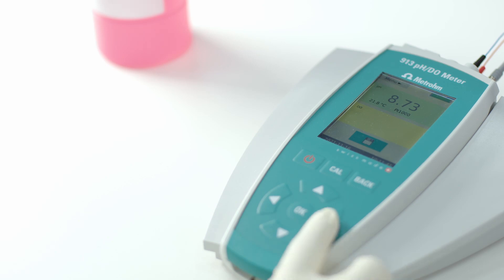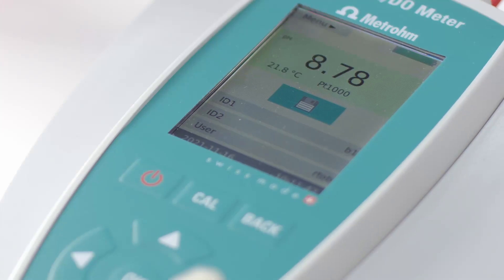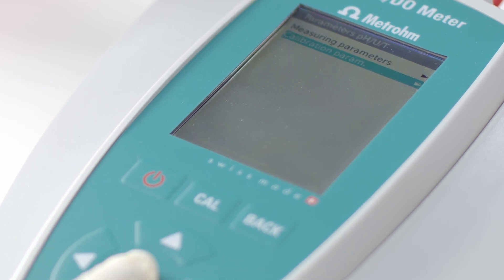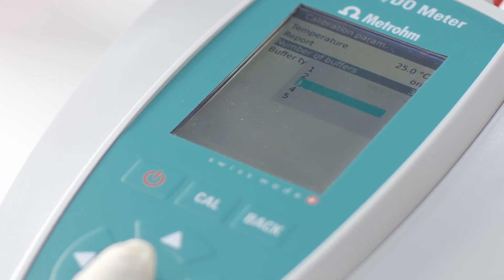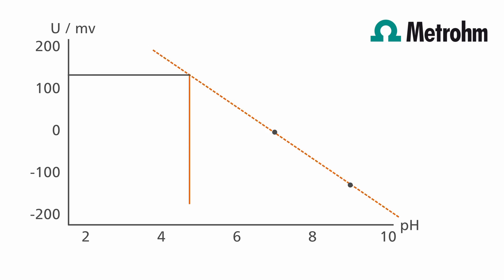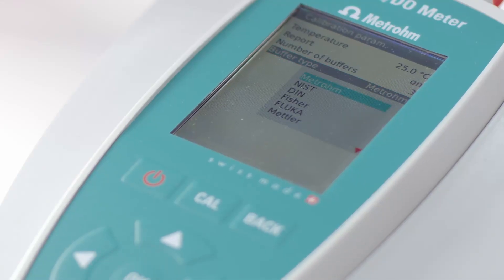Select the corresponding measuring channel in the main dialog. To set the number of buffers, go to the menu, select the calibration mode, and then the number of buffers you need. You should always use at least two buffers for a calibration, which bracket the expected pH value of your sample. For higher accuracy or samples with an unknown pH value, it is better to use a multipoint calibration with at least three pH buffers. In addition, select the correct type of buffers which you are using for this calibration. This is important for the correct calibration.